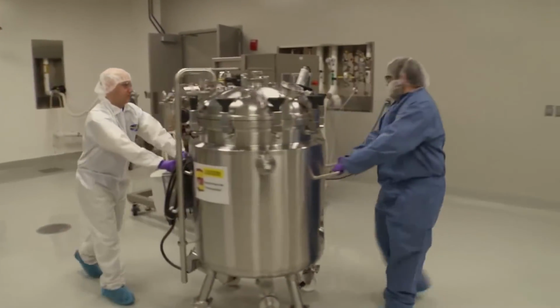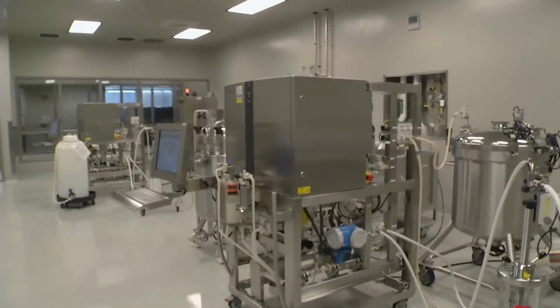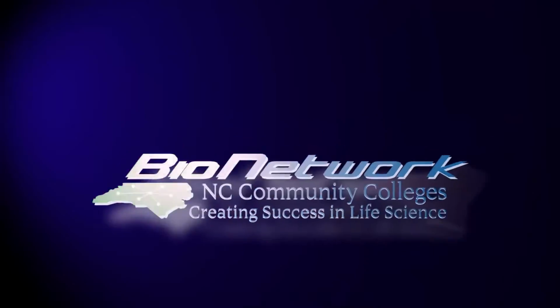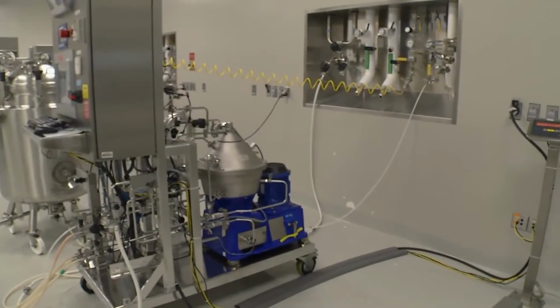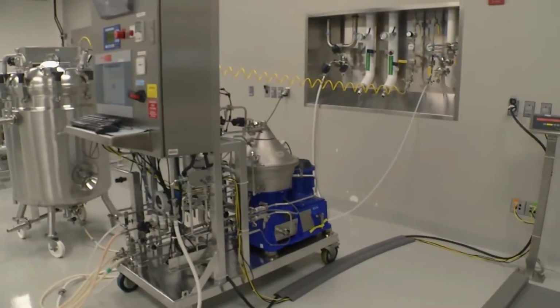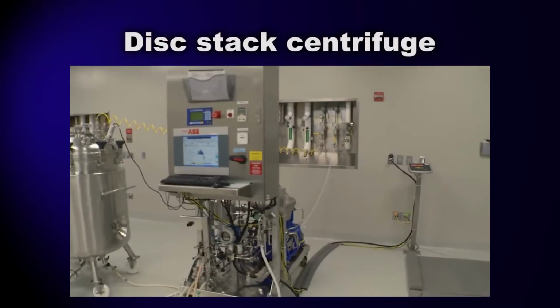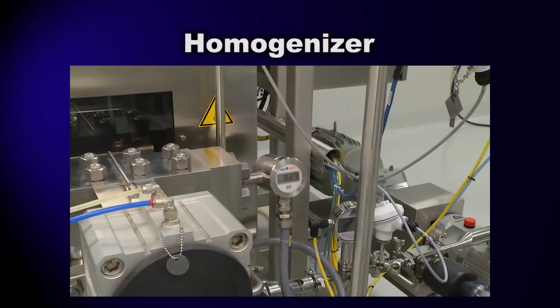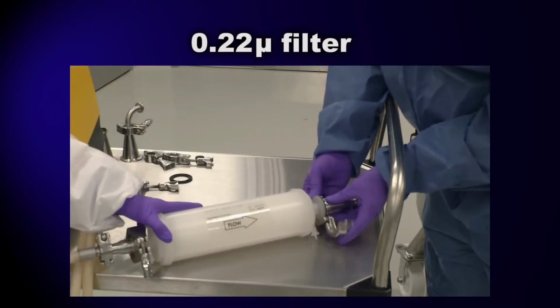But to really understand recovery, we'll need to closely examine our process so we can appreciate what each step accomplishes and why it's important to the process. Let's start with the tools we'll use in the green fluorescent protein recovery process. Those would include a disc stack centrifuge to separate solids from liquids, a homogenizer to break open the E. coli cells, and a 0.22 micron filter to separate any remaining solids in the product solution.